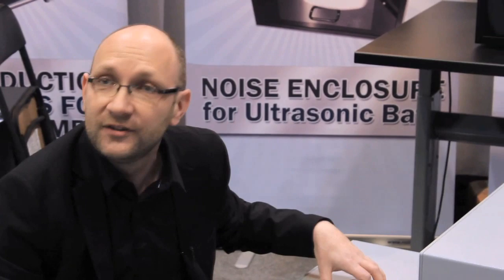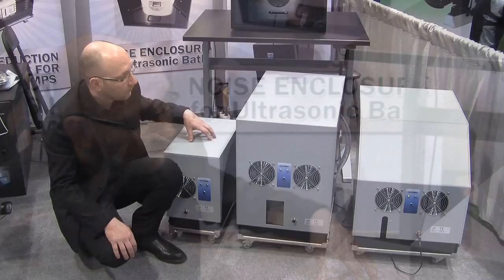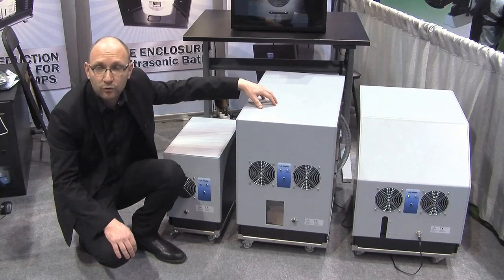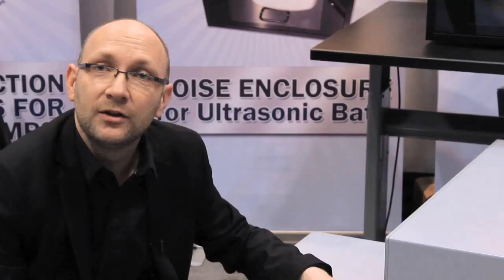This one, for example, is a noise enclosure compatible with the GCMS from Agilent. This one is compatible with an Edwards pump, also provided by many manufacturers, and the last one on the right is for a Leybold SV40 provided with the SQD and TQD from Waters.